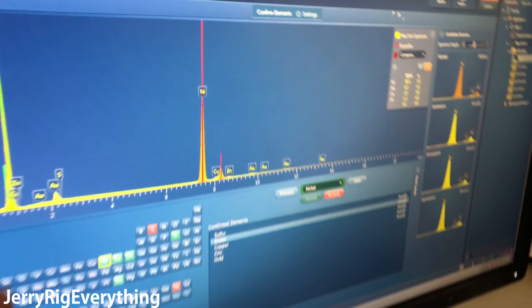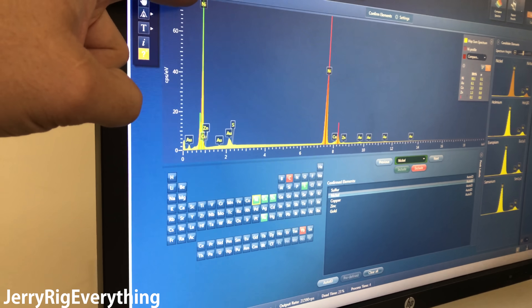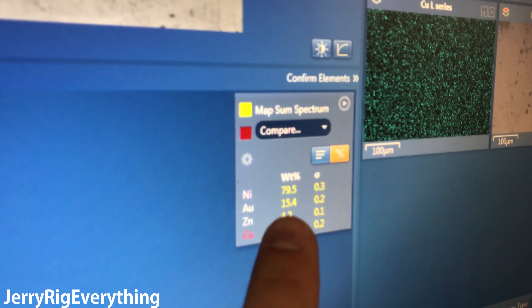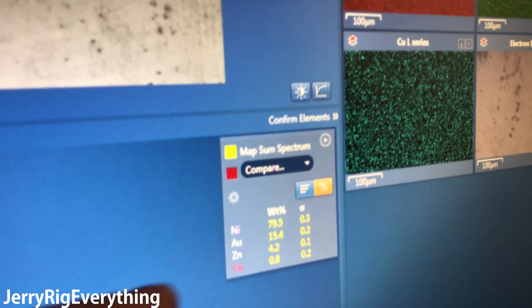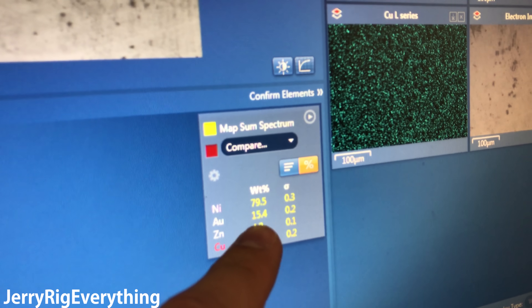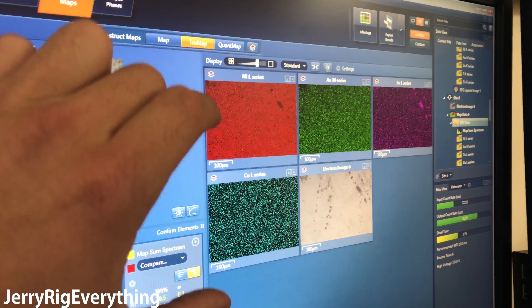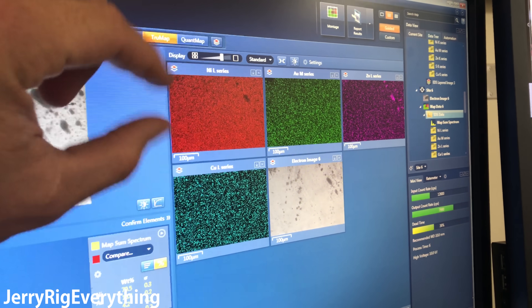On this screen we have a readout of what the play button is actually made up of. We have nickel here and also a little bit of gold. There's a huge chunk of nickel and then gold right below that at 15%, and then we have zinc and copper, making up something like a brass alloy. On the surface, most of it is nickel and gold, and you can see it's evenly dispersed across the button.